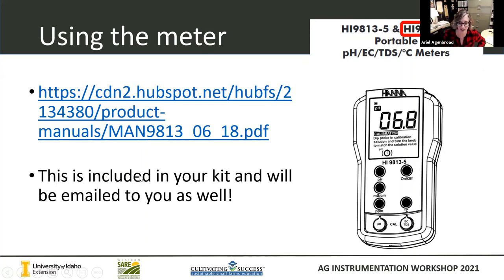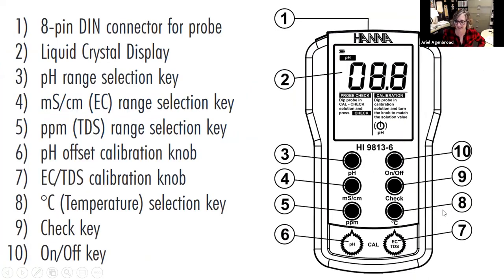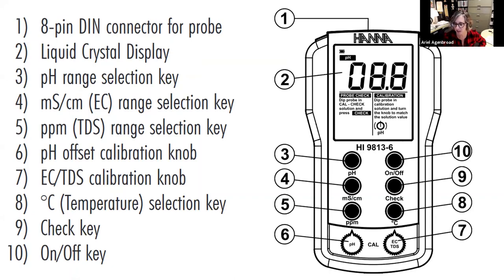Basically, this is the interface of your meter. You have a probe connector up here, an LCD display, and a bunch of buttons depending on what it is that you're going to be testing. Buttons four and five are your EC measurements — you can either measure in millisiemens per centimeter or in parts per million. You've got your pH, your temperature, on and off, and then there's a check key which is exclusive to this model. You also have calibration knobs six and seven — these are actual knobs that you can turn to help with calibration of the instrument.